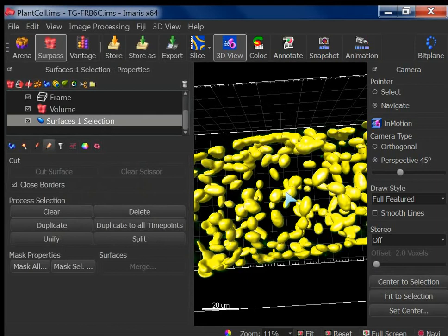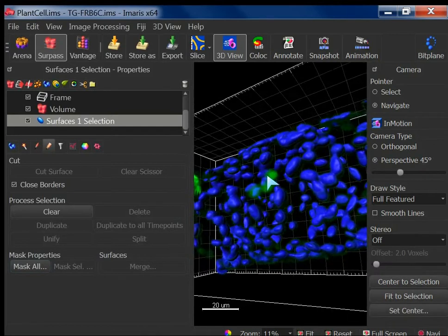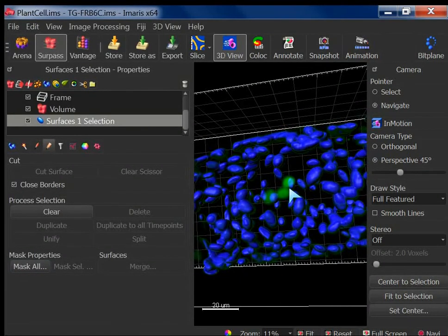In the edit menu, I can go to the select mode. Select this guy. Let's say I delete this case. So I can say delete here. So delete it now. Don't get confused with this one. This is different because it gives you an illusion, right?